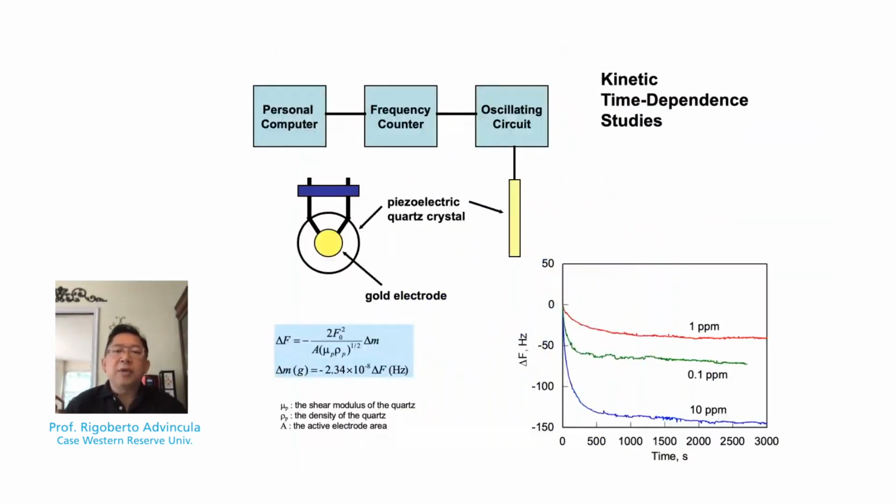Another representation that we have done, for example, is simply monitoring the kinetic or time-dependent studies.